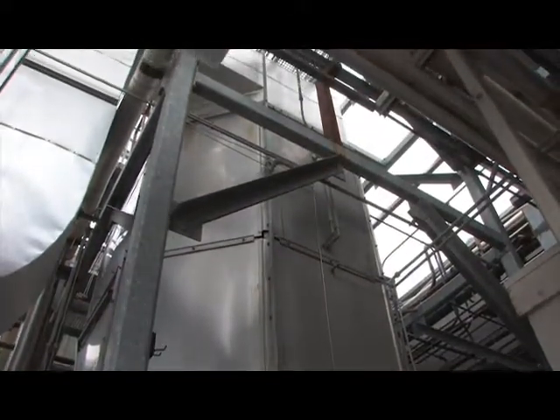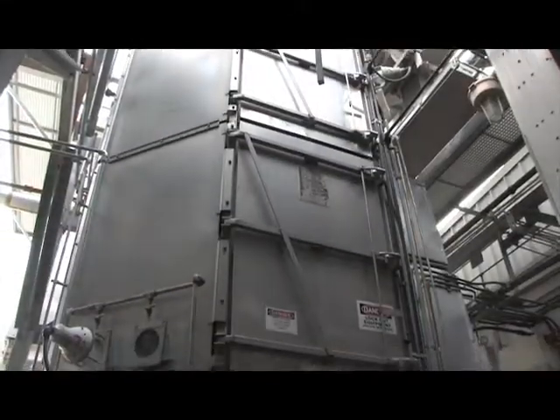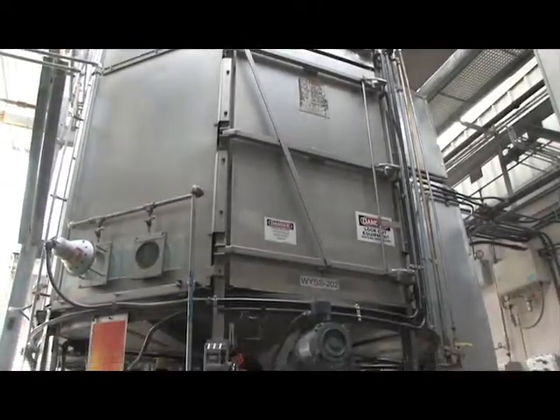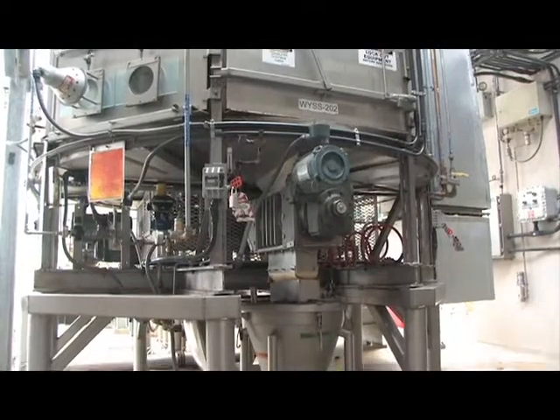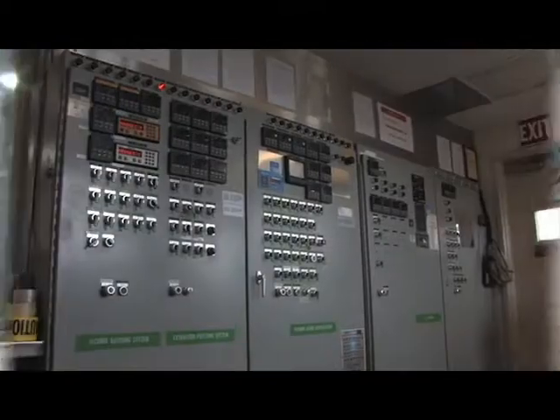It has a bag dust collection system so that it meets AQMD emission standards. It has a recirculating air system to reduce energy costs. The system can be serviced by OEM for both parts and service.